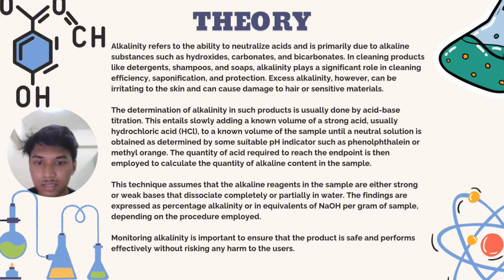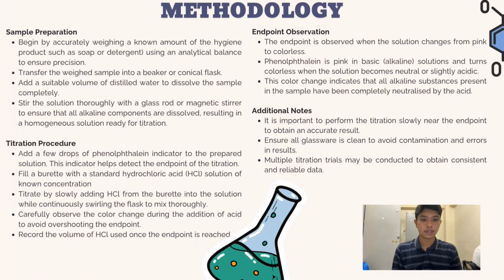The findings are expressed as percentage alkalinity or as equivalents per gram of sample, depending on the procedure employed. Monitoring alkalinity is important to ensure that the product is safe and performs effectively without risking any harm to the users. Next up, I will explain about the methodology.